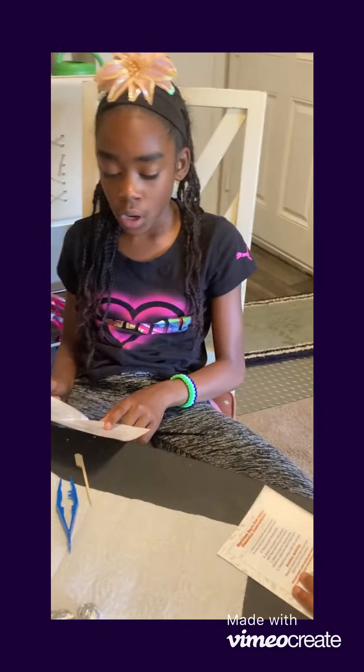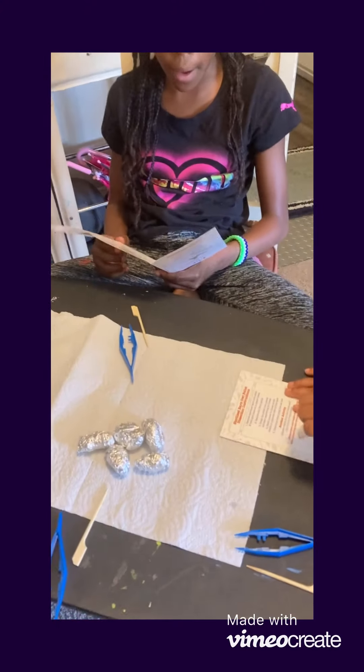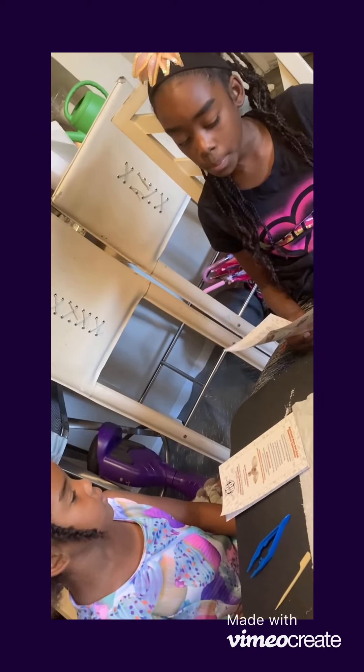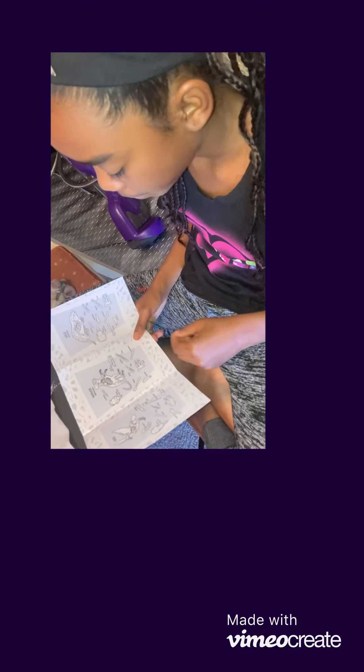There may be a femur bone from a bird. So if you see a bone that looks like the femur bone, maybe it is part of a bird. If you see a mouse skull, the skull of the head is very big. If you have a vole, the skull is also very big and very wide. But the bird's skull is very thin.